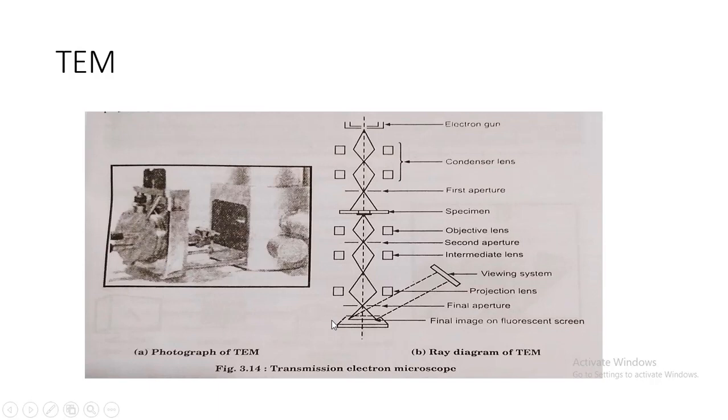An electron beam has low penetration power through solid matter. Hence, very thin sections of specimen can be examined under an electron microscope. The degree of scattering of electrons by specimen is related to the number and mass of the atoms that lie in the electron path. Since most of the constituent elements in biological matter are of low mass and the contrast of these materials is weak, the contrast of such materials can be enhanced by staining with salts of heavy metals such as uranium or tungsten.